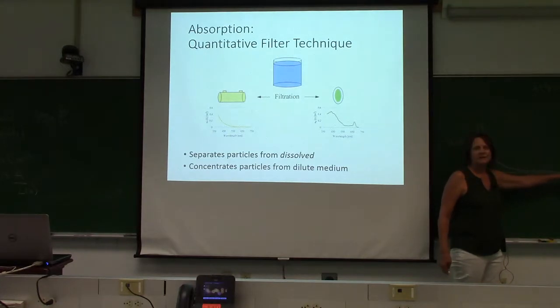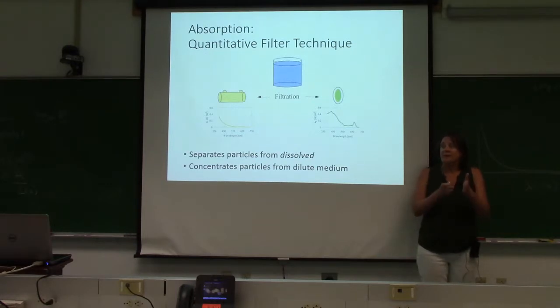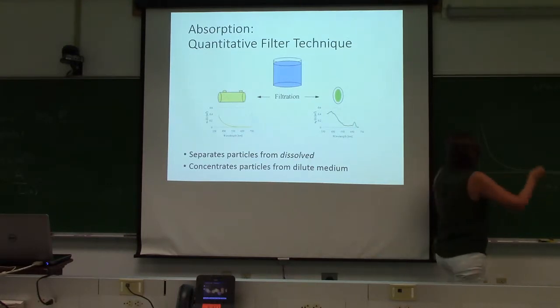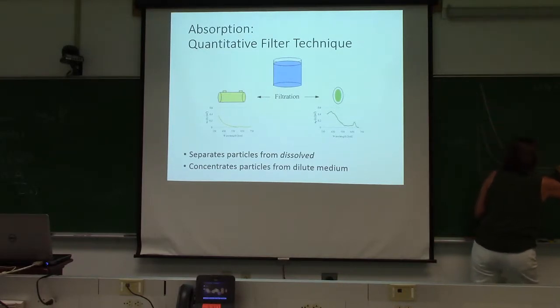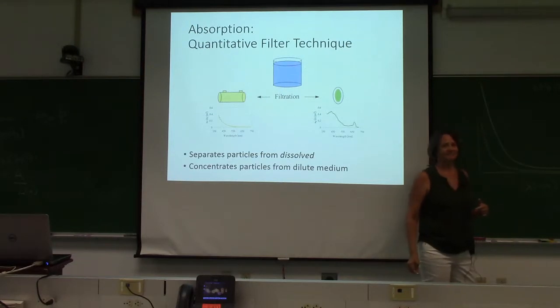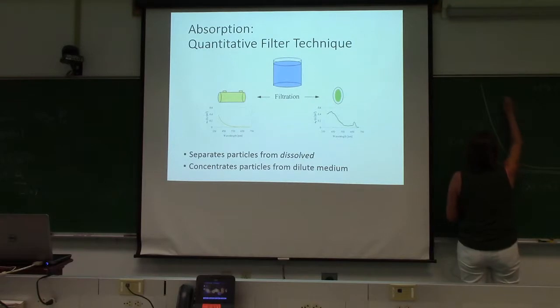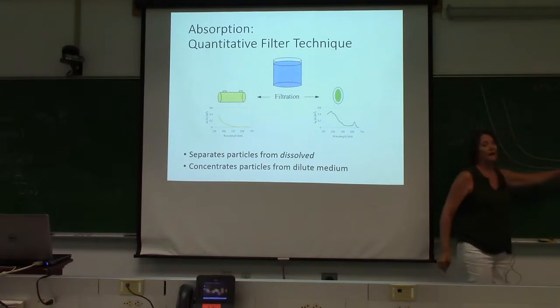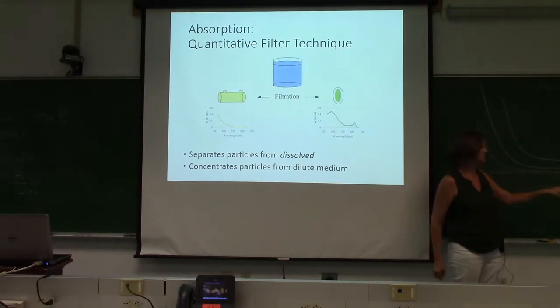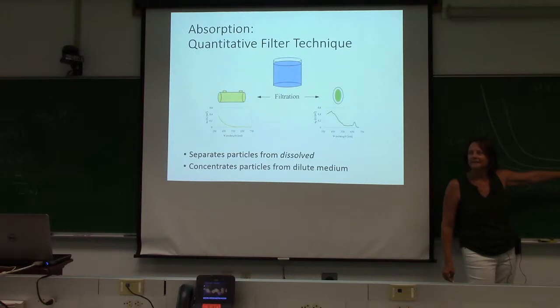But you have to think really hard, because if we had this same sample, but maybe it was twice as thick, or maybe we doubled our path length, we would have twice the absorption. So now it looks like that. And what if it was even thicker? You get to this point where, if it looks like this, that's a lot of absorption to have to remove. So just because it's really small, you're like, oh, I'm just going to subtract it. You have to, in your mind, think, would I subtract it if it was multiplied by 10?